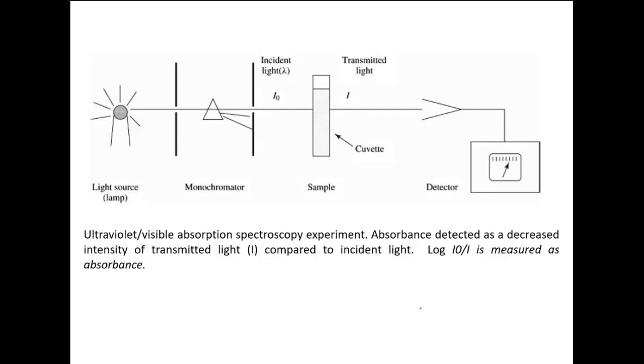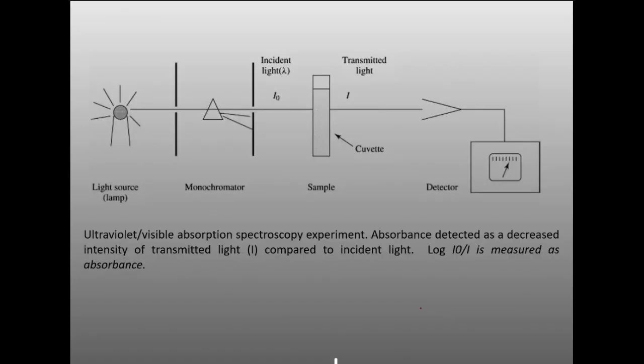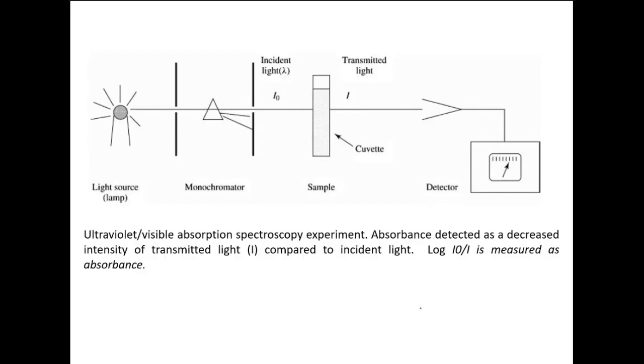There are some circumstances where you have to use only the term optical density, where you cannot use the word absorbance. For example, you are trying to construct the growth curve of bacteria at different time points. You are going to take the absorbance at a specific wavelength of light, but in that case you should not use the term absorbance.